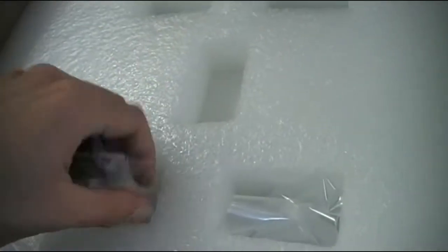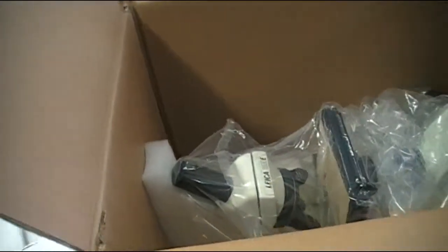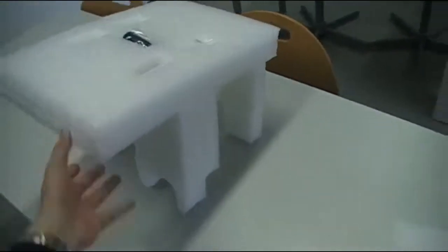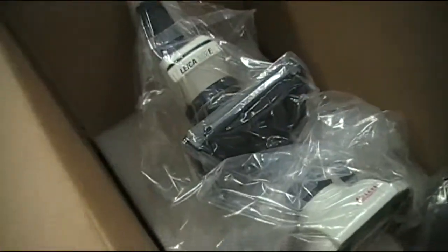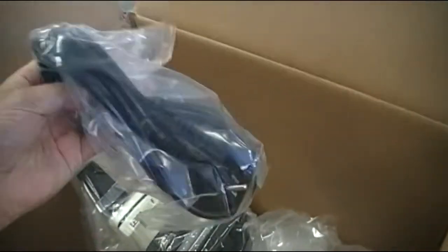Okay, all nicely packed. I'll carefully take it out — oh, it's kind of tight. At least it's packed well so that the microscope is not damaged. Okay, here we go. We put this to the side a little bit. Okay, here it is.